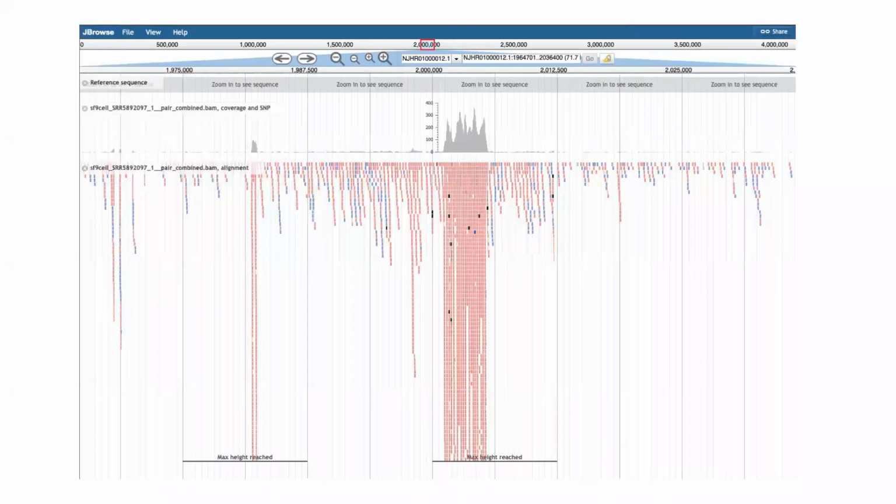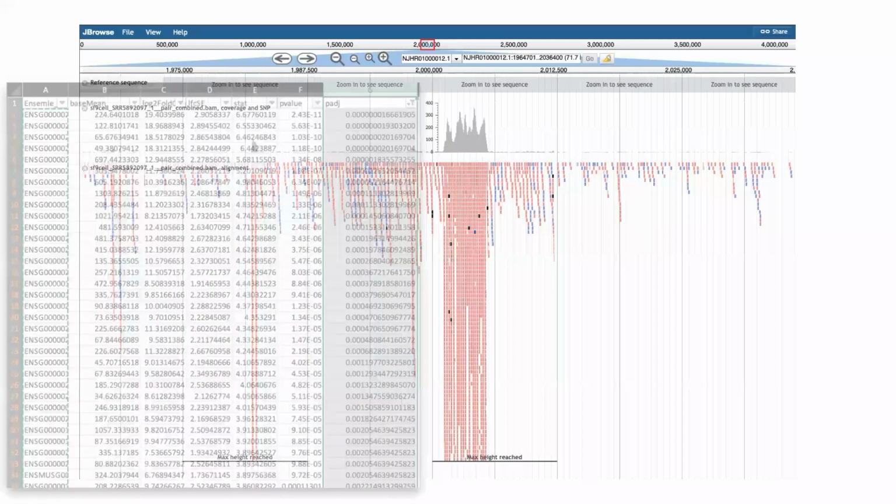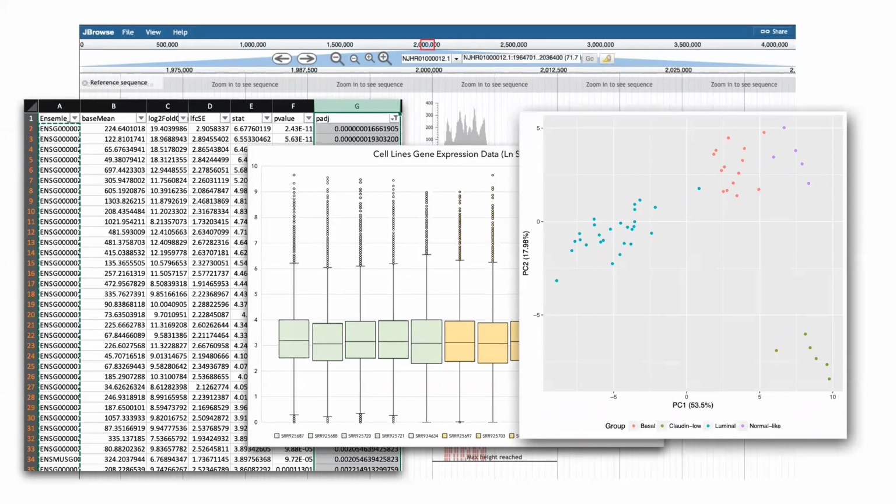Now, what's important is that many different pipelines are designed to produce different types of outputs. And we can go to a very detailed read level analysis where we can understand the mapping quality and the read alignment for different types of data that is being prepared, to then understanding the outputs or the gene expression table, gene or isoform expression table. We'll talk about how to read these different types of outputs, visualize them, and also perform analysis to summarize and explore the specific patterns within the data that we prepare.